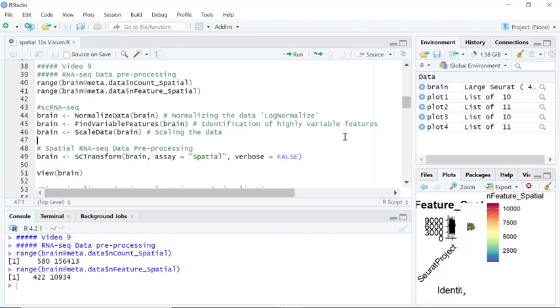So Stuart developed a better data normalization method called single cell transform, or SCTransform. It is the recommended method for spatial sequencing data preprocessing.